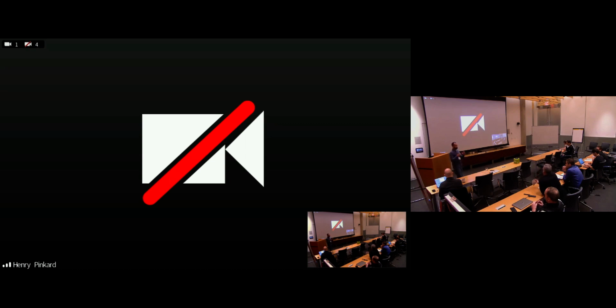So hopefully there's a low-level platform where the experts are driving all the cool development, and then semi-experts have an interface to a high-level language that they can use to do things with their microscope and talk to microscopes easily, and it's not something that is frightening for an amateur to pick up and learn from.